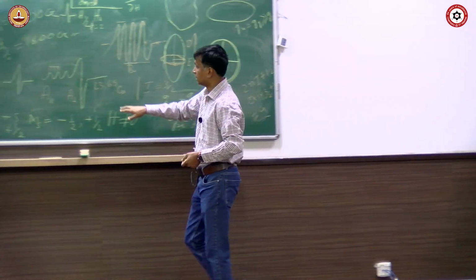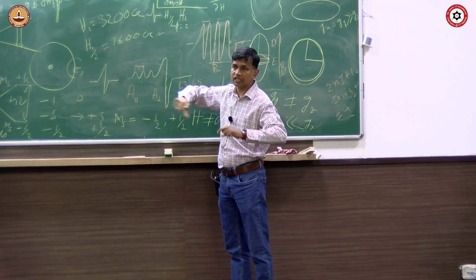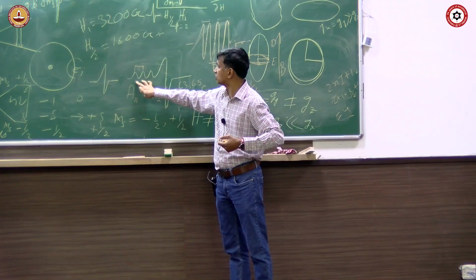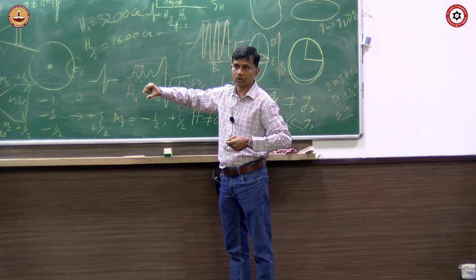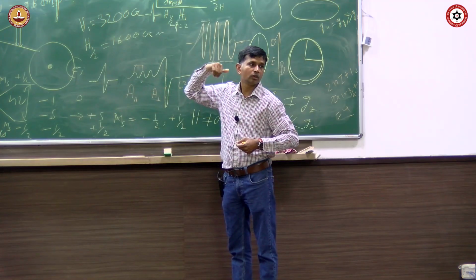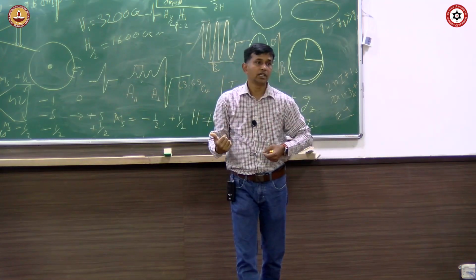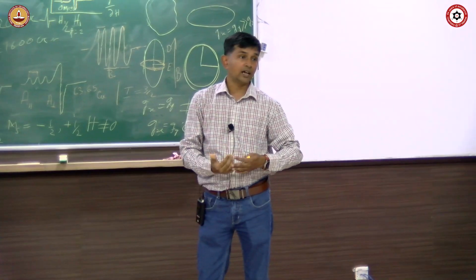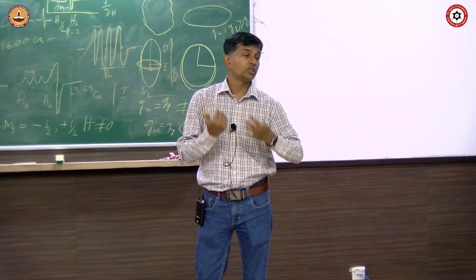So now depending upon the nature of the bond and distortion, this separation will change, the lines will become closer or become wider, and that is something important in bioinorganic chemistry to characterize which kind of environment, which kind of metal center.